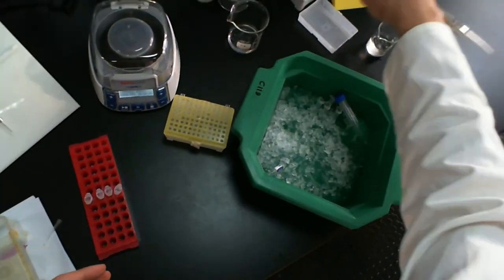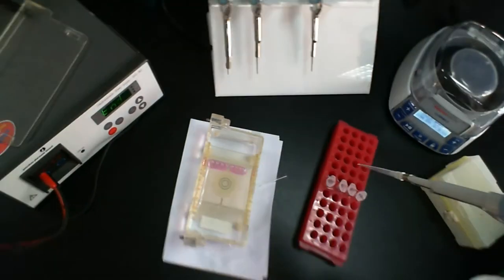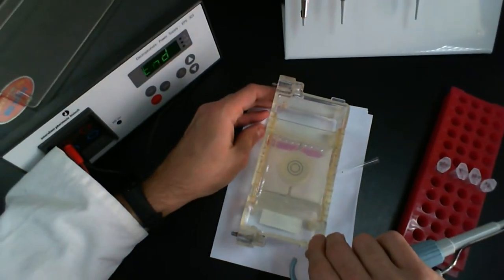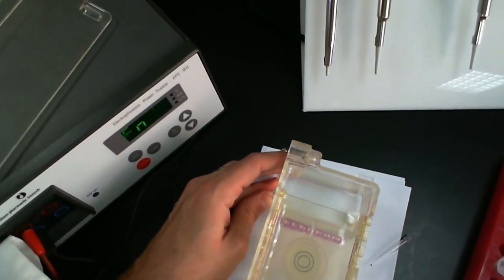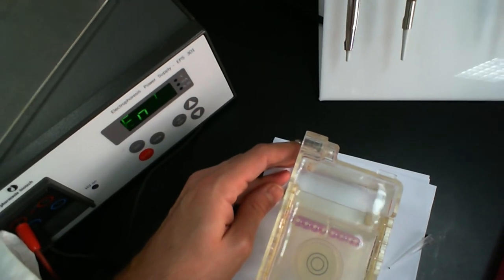Move this a little closer. And let me show you loading the gel. What I've done is I've drawn a pink line underneath this so you can see the wells a little bit better. Hopefully this helps, because the wells can be a little difficult to see sometimes. So you can hopefully see the wells relatively well here.